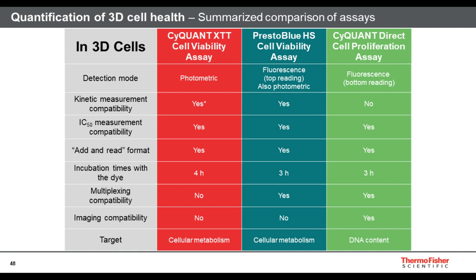Well, I really hope that we have been able to demonstrate to you guys the suitability of these three assays for these comparative studies between 2D and 3D, or even for just studying or interrogating cellular health functions in 3D cells. Here you can see a summary of the different issues that were discussed by Leticia.